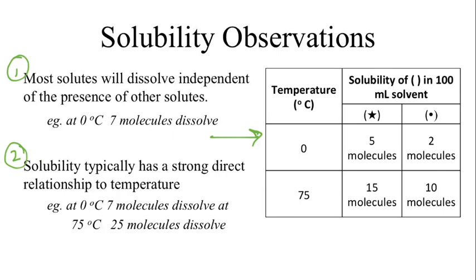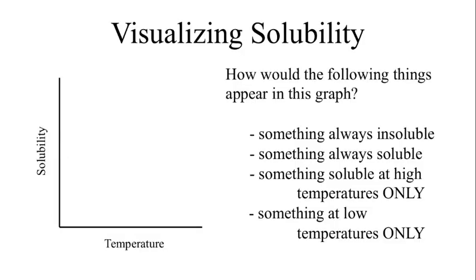of recrystallizing. The next thing is to put it all down into a graph to make sure that we understand what's happening with solubility. Before we actually start interpreting the graph, we're going to do what might be considered a bit silly. I want you to think about and label your graph with the obvious information first. So what's that obvious information? Well, see the little red dot there? What can you tell me about that red dot?